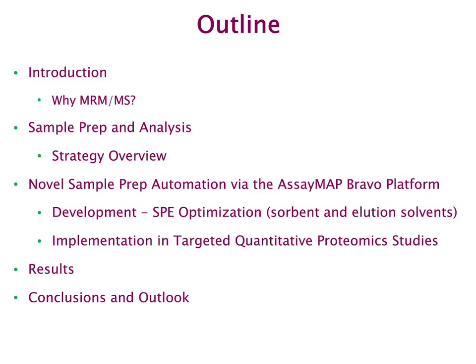The Translational Science Lab at AstraZeneca R&D Malmö have developed a fully automated sample preparation workflow for the robust quantification of human plasma proteins using the Bravo AssayMap platform from Agilent Technologies. During the next 30 minutes, I will present some results that we have obtained using this versatile platform.